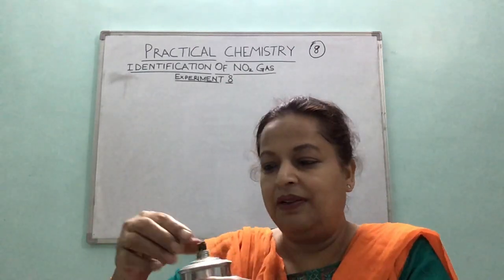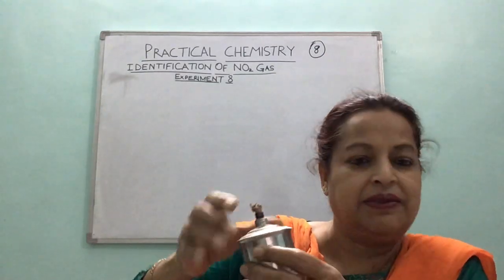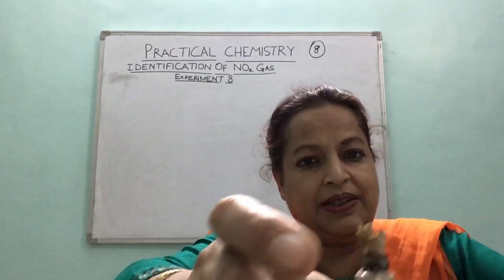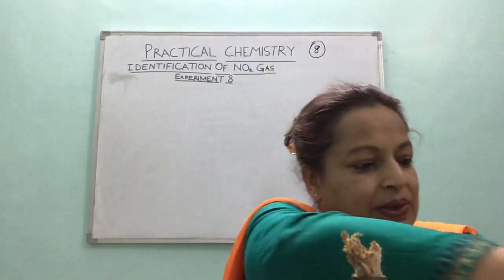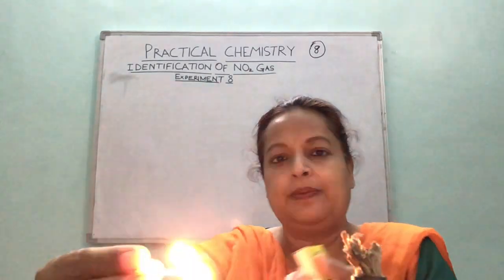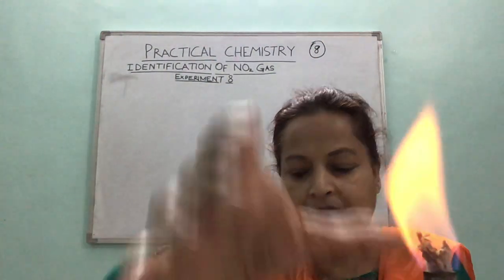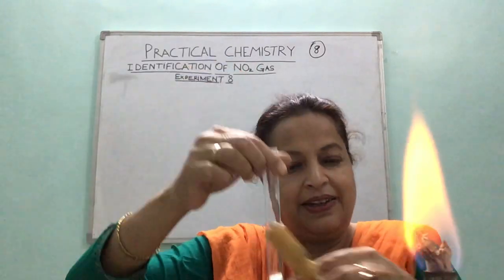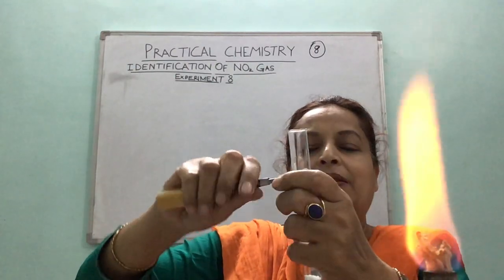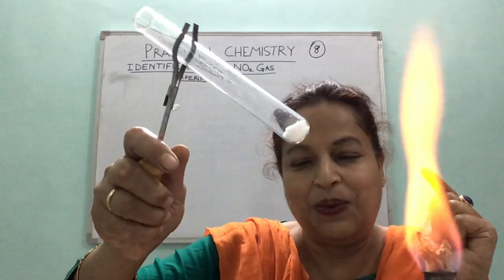So first of all, I have to start with the... I'll need a matchbox, right? So we'll light it. Now you can see it also. Okay, and what we need, this is lead nitrate, and I need a test tube holder.